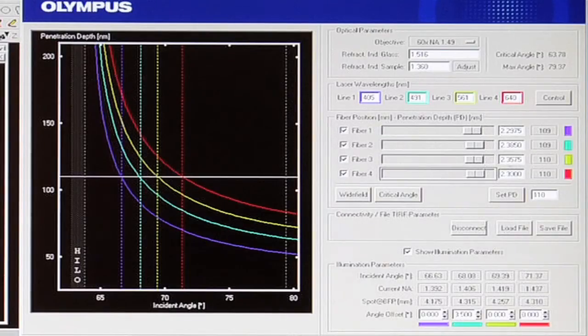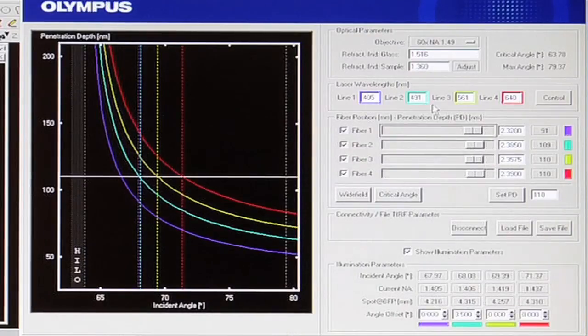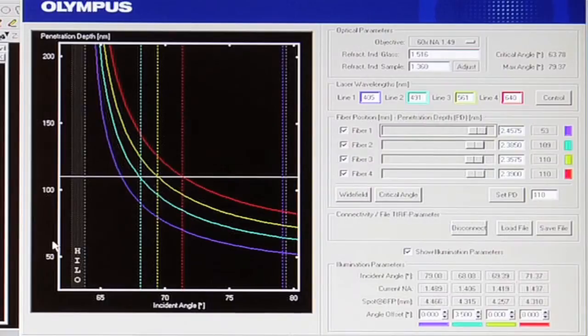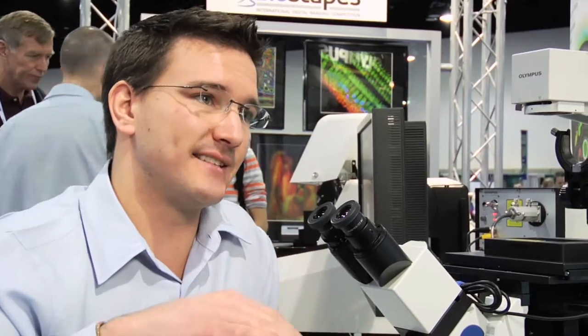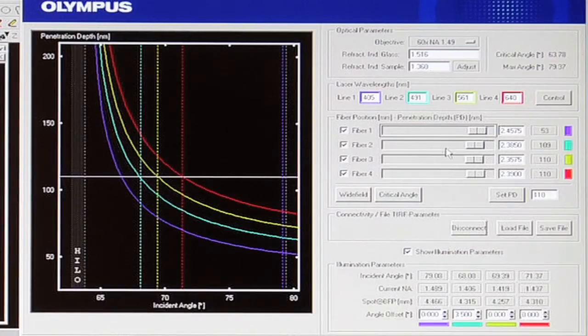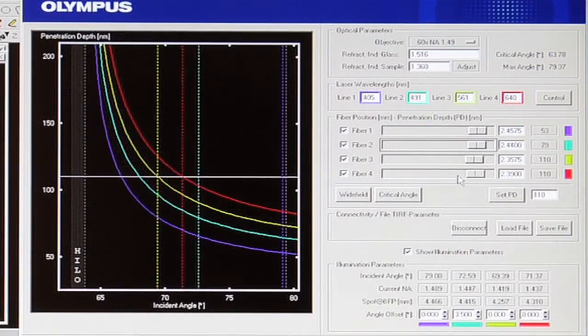Something else that we can do is be able to monitor up here on the software and take each wavelength down to the highest possible incident angle, giving us the lowest possible penetration depth. That's particularly important for when people are looking at cells. They want to be insensitive to the different organelles having different refractive indices. So being down at the steeper angle, at the higher angles really makes you insensitive to that. And so it's nice to be able to see where you are for each of the wavelengths and know that you're getting as close to the extreme of the objectives capability as possible.